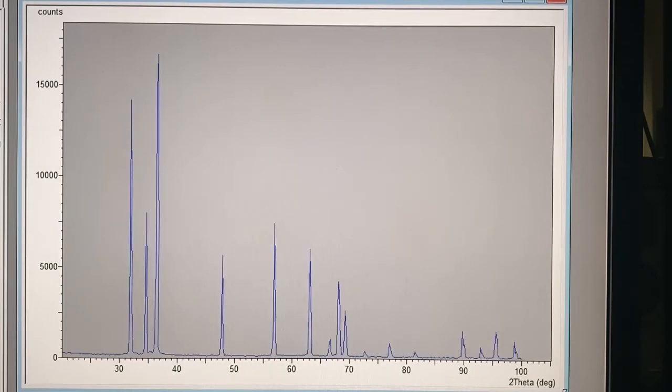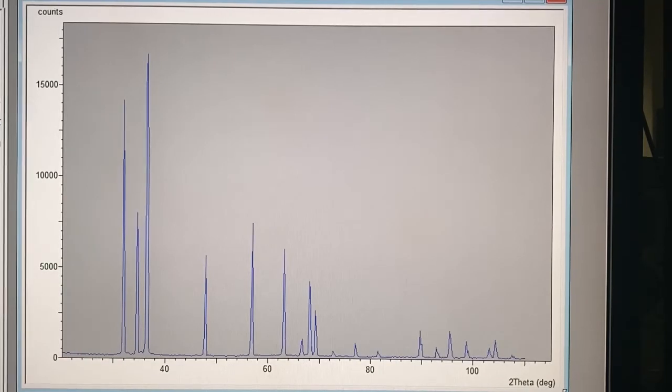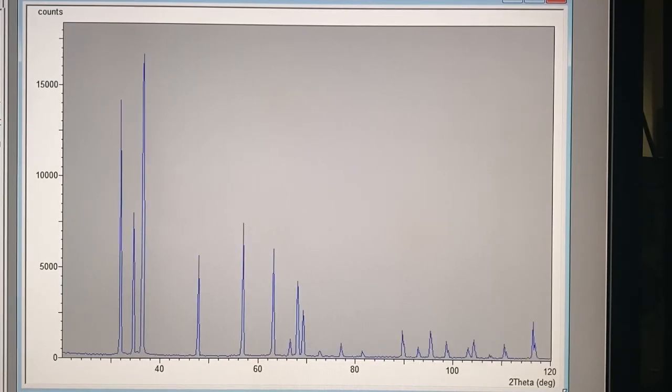We know that these samples are all metal oxides, and their commonality is that they're all metal oxides that happen to be white in color. This may be helpful information as the color of the material is also related to its composition. But I have chosen oxides of the same color to make the phase identification process more challenging. We're providing a small database of the corresponding d-spacings of approximately 40 known oxides.